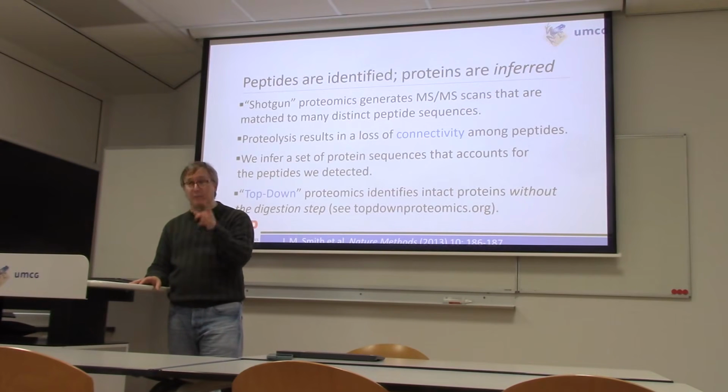Can you fragment ions of an intact protein in a tandem mass spectrometer? You can. Do they fragment well?